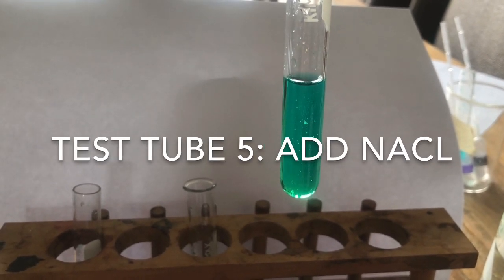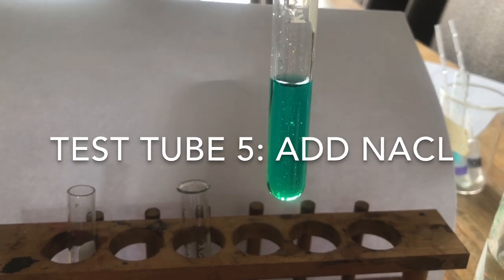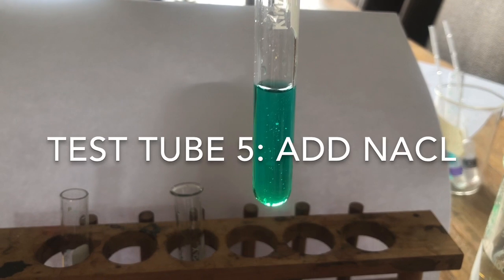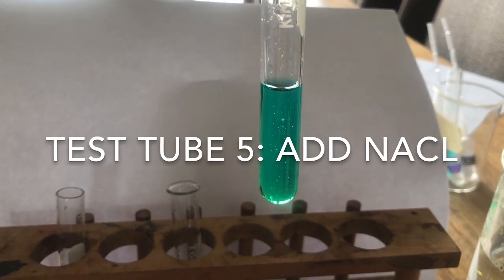So in your pre-lab, make sure you note all of the color changes and the shifts, which direction, left or right, and the reasons why the reaction shifted.